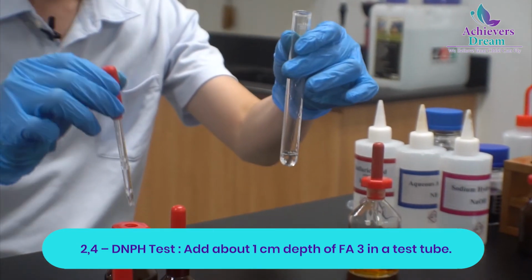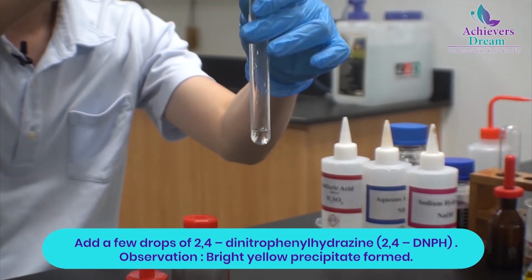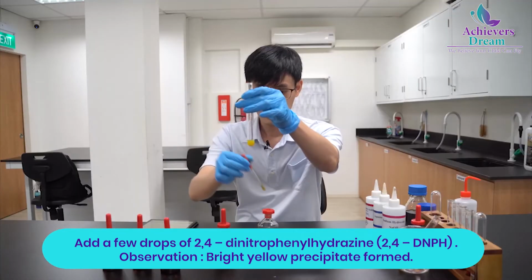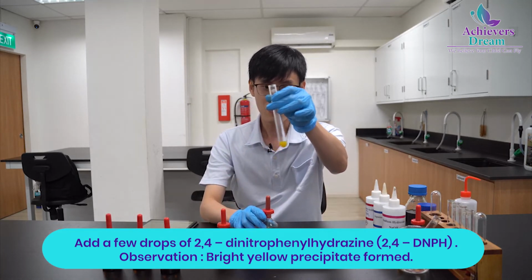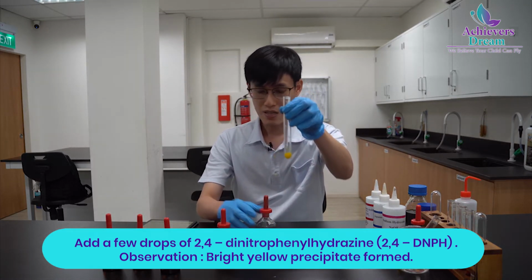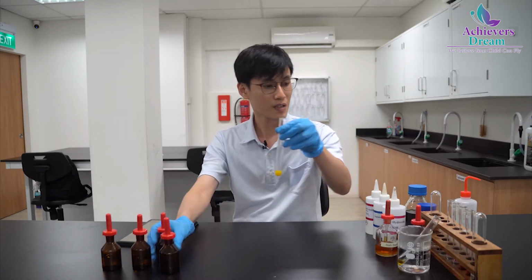After which, we will be adding some 2,4-DNPH. Just a few drops will do. Wow, look at that. There's an immediate appearance of a bright yellow precipitate. Well, it's a little bit orange, so we can say it's a bright orange precipitate too. That's the key for organic QA. You have to be flexible with the observations in practice.